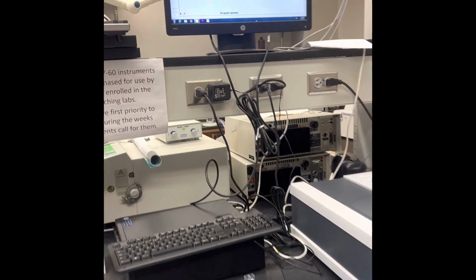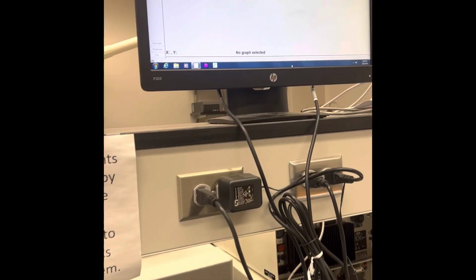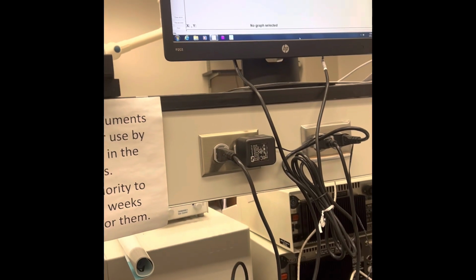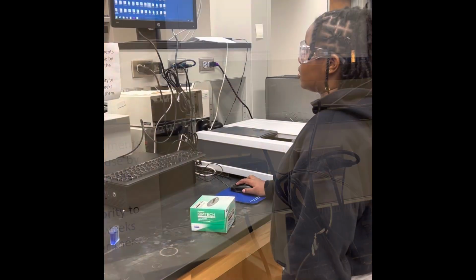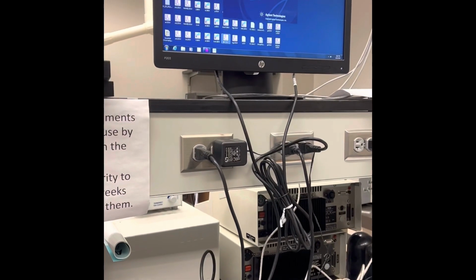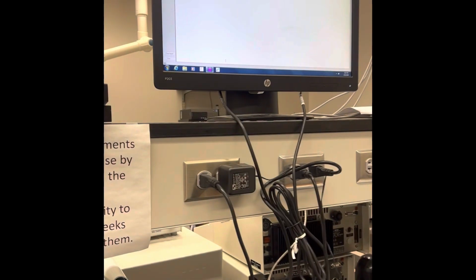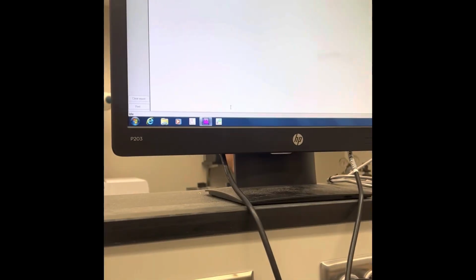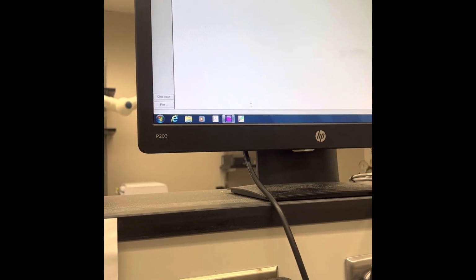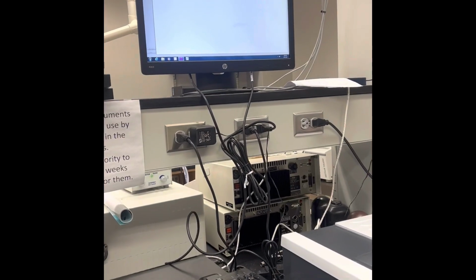Hey everybody, this is our spectrophotometer lab, and in this lab we will be demonstrating the Beer-Lambert law, which is essentially the law that describes the linear relationship between the concentration and the absorbance of a solution. So by now the dilutions have been made, and next you go to the computer and hit 0 so that you can load your blank solution.